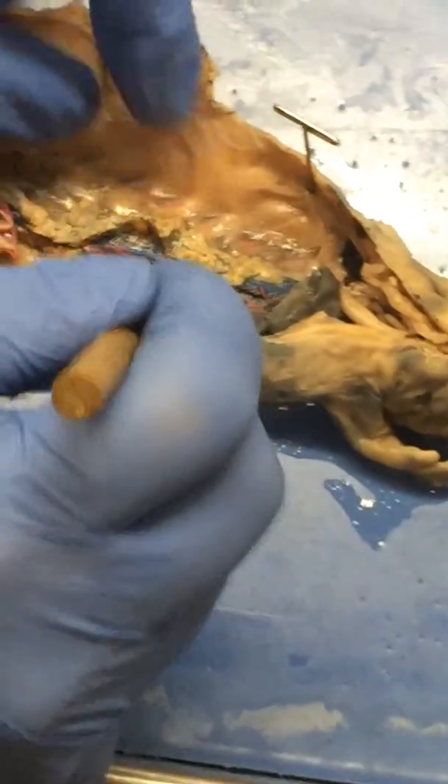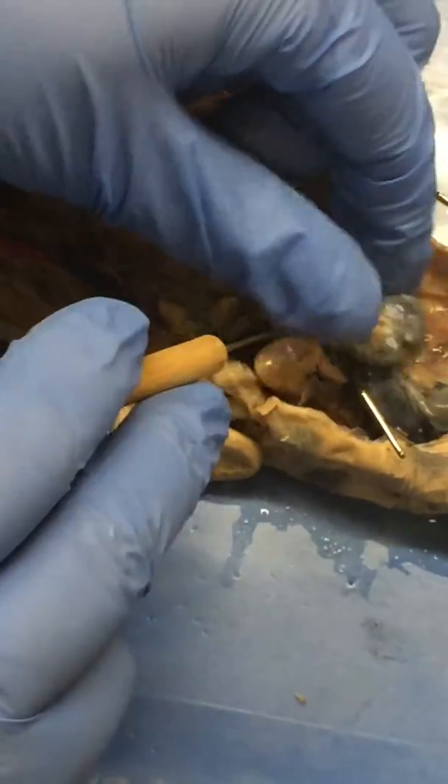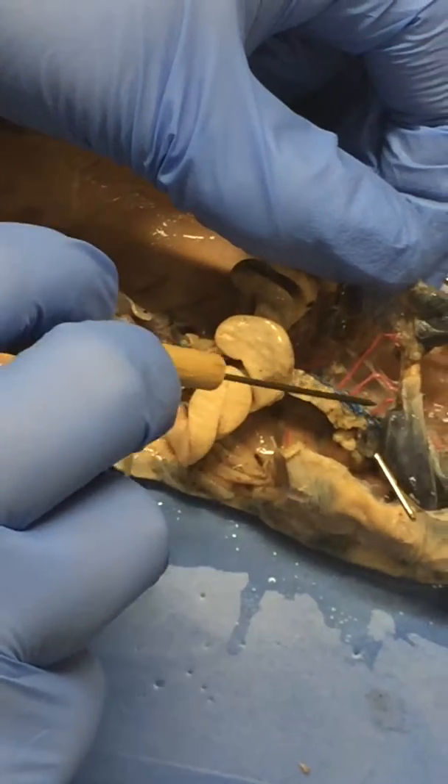What about in the mesentery? So this is our mesentery here. When you kind of pull it up — there's your mesentery arteries.